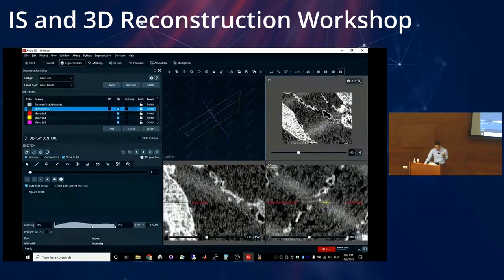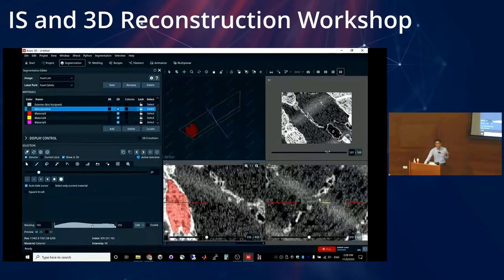So what that means is you can actually go here and brush on these regions, right? So maybe from a different perspective, you see the structure more. And there are cases where that's true. That's a very good question. So yes, you have the freedom to pick whatever slice you want to use.